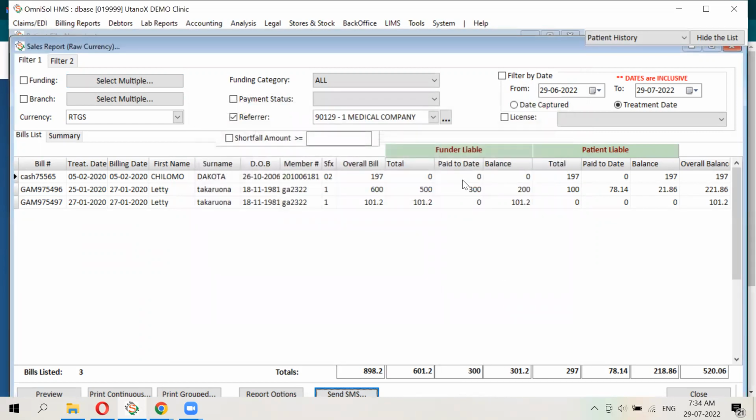Okay. Then lastly, but not least, how much is all this? How do you do your charging? How do you make your money? So we send you a questionnaire, because every lab is different, every facility is different. So we send you a questionnaire that enables us to estimate the scale of your operation, and through engagements, we then establish what kind of resource commitment will be required from our end to give you fair service. And from that, then we agree on pricing.